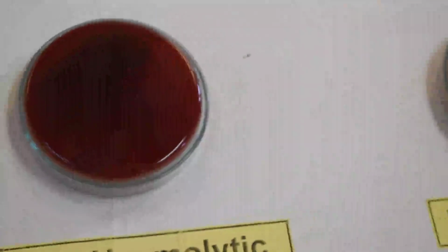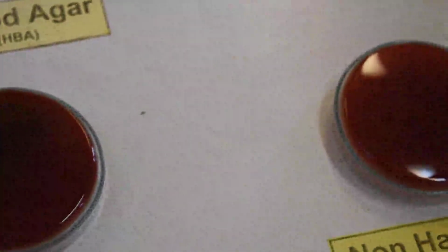Then the other type of streptococcus, depending on the type of hemolysis, is the non-hemolytic streptococci or gamma hemolytic streptococci. When you look at this plate, you can see again the small colonies, and there is no clearing around the colonies. That means no hemolysis around the colonies. So this is described as gamma hemolysis, though there is no hemolysis.